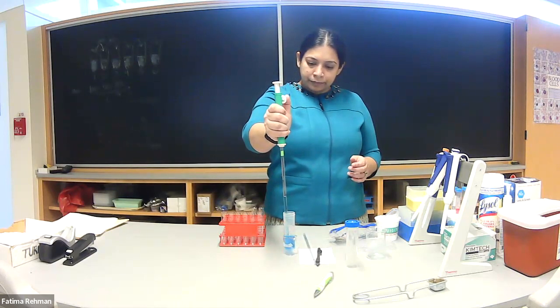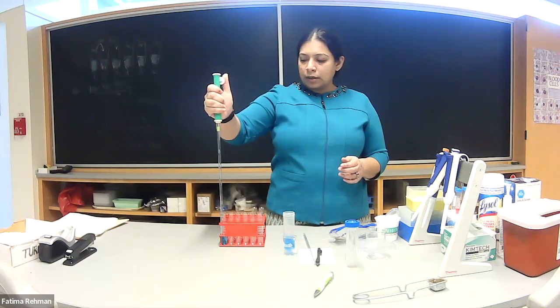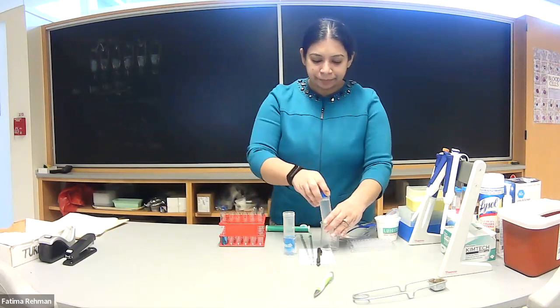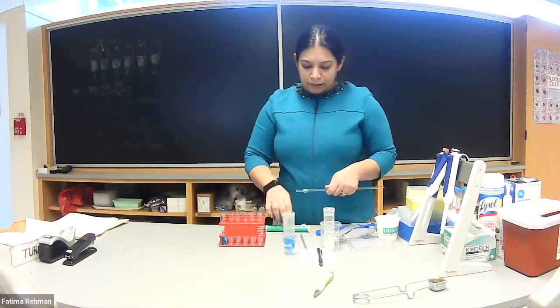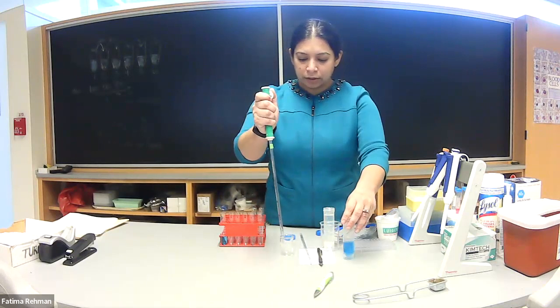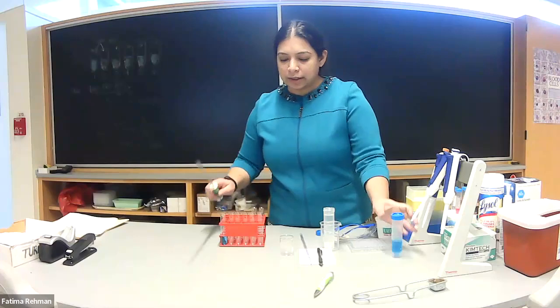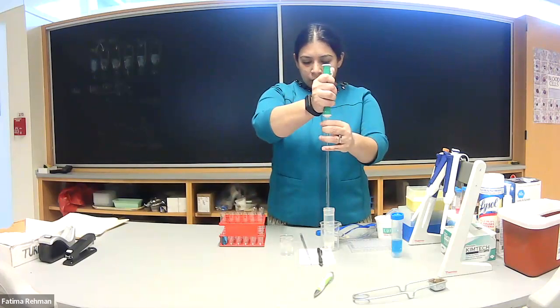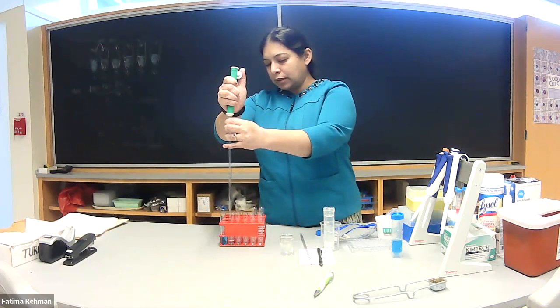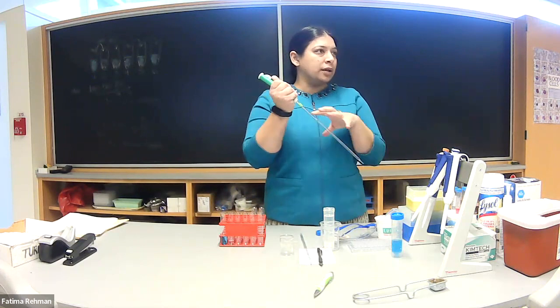I'm going to take my 4 ml of methylene blue and verify it's correct. Then I take my other pipette for water. One thing to always be mindful of: if you're done with something, put it away and close the lid so it's less likely to spill. I can get 2 ml — or 2.3 ml, whatever the volume — and do each tube separately. In between I take the pipette off and push it back in to make sure there's no residual liquid leftover.